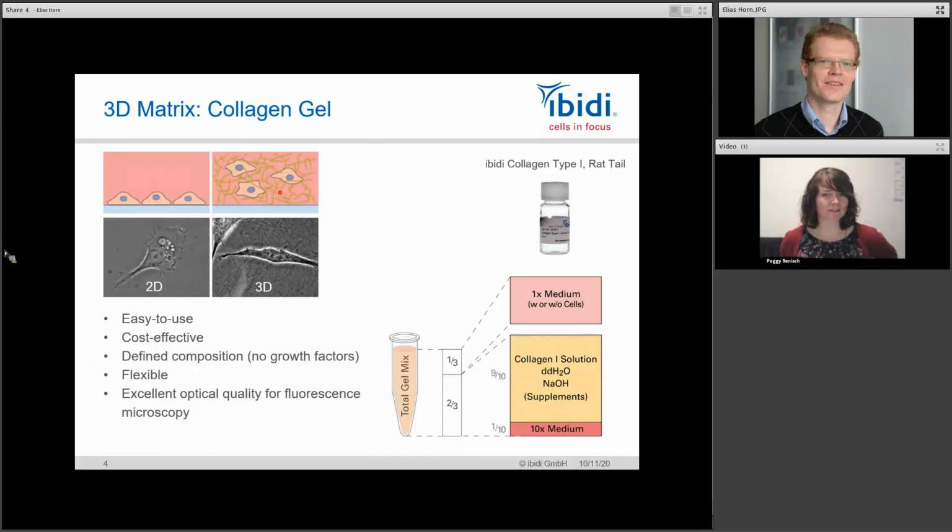So that it polymerizes quicker, I believe. Yeah, if you polymerize it quicker, or some people also flip the whole thing upside down during the polymerization phase. So every 5 minutes they do an upside-down turn. The cells will sink in a certain direction, and then you flip it, and they sink again. So while the gel is forming, you keep them in suspension, so to say.